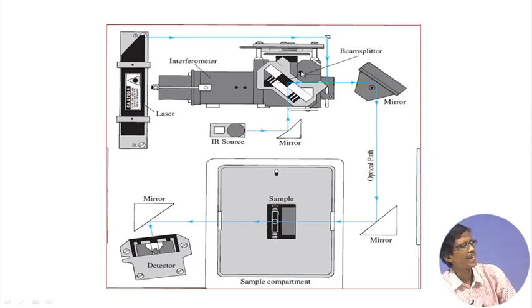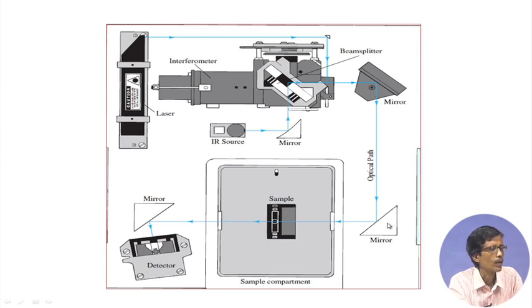The beam is getting split, and the whole thing happens within this interferometer. This interferometer is responsible for recording the corresponding signal amplitude when we have the chopping off and on of the radiation which is forwarded to the sample. This again goes via the mirror, and then this optical path is again guided by the mirror.